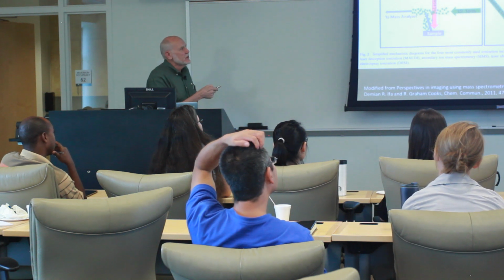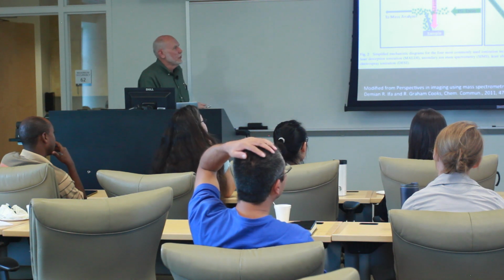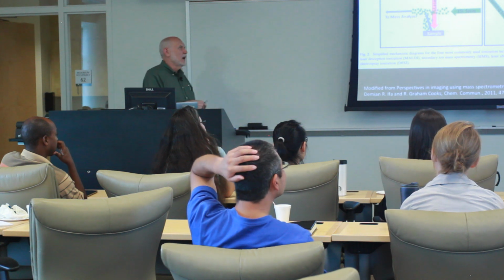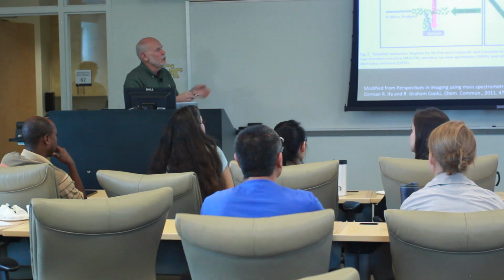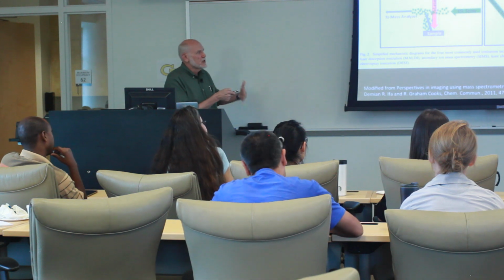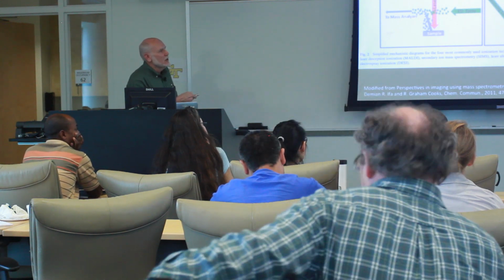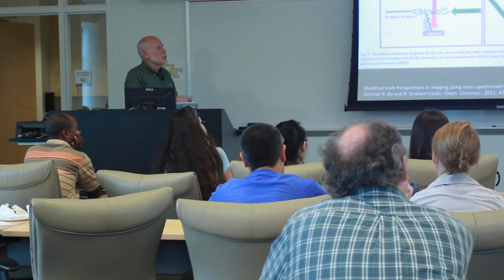The problem with that is that this is of such high energy that the molecules of interest to us, biomolecules, are chemically destroyed, and what you're often measuring is a very fundamental molecule like carbon dioxide or ammonia. That's what's left after you've broken it down. So what people usually use if they want to orient something by a SIMS method is a molecule-specific stable isotope, so that they're measuring that stable isotope. There's an emerging method that uses lower energy ion beams, things like charged fullerenes, that are able to bring ions off the surface that are closer to what the parent mass is.